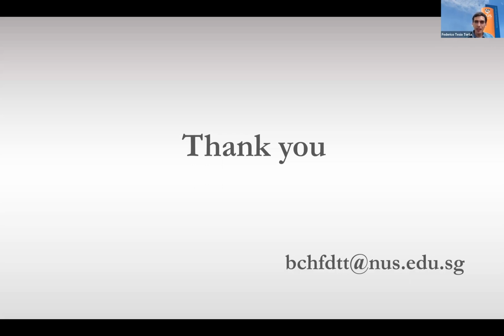With lipidomics, I think we are still playing around with it, especially with the data analysis part, because it's not trivial, right? Because you're going to fragment everything. But of course, there is software like MS-DIAL that now probably performs quite well also with that. So I think it's really up to the expertise that you have established in the lab, what to choose, probably. So maybe, Maria, you have more insights about that.